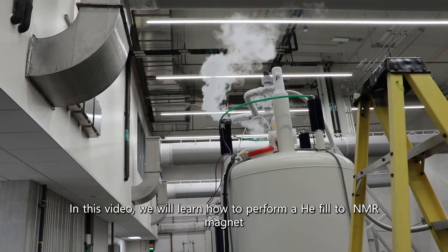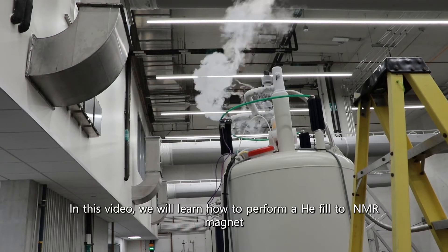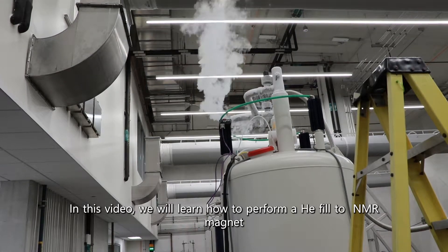Hi everyone, I am Nasreen. In this video, we will learn how to perform a helium fill to an NMR magnet.